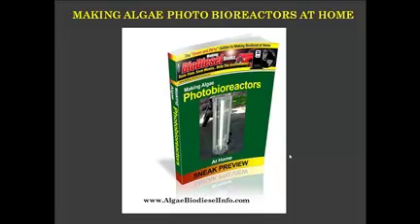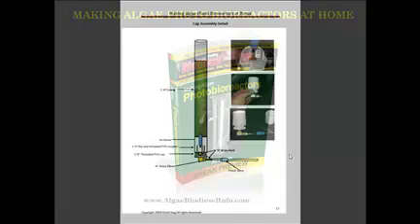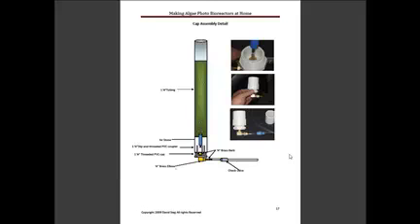Hello and welcome to our Making Algae Photobioreactors Sneak Preview. Today we're going to show you how to make your first bioreactor. Here are some of the pictures to help you get started.